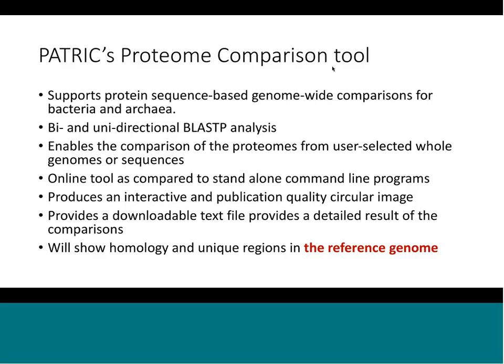Now, there are several tools that do this kind of stuff. The PATRIC Proteome Comparison Tool is different in a couple of ways. One is that it's an online tool. It's not a standalone command line program. You can launch this via the website, and it will return your results for you there. You don't have to know any programming to be able to do it.